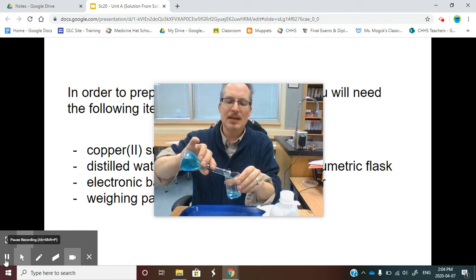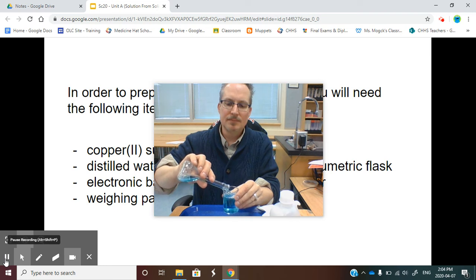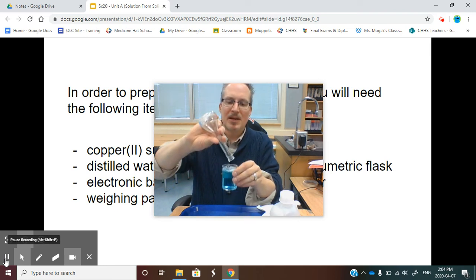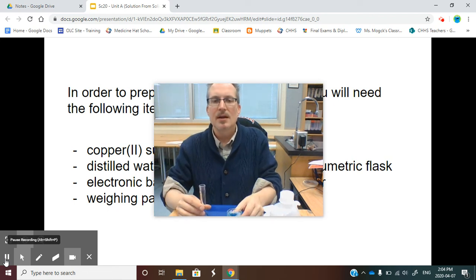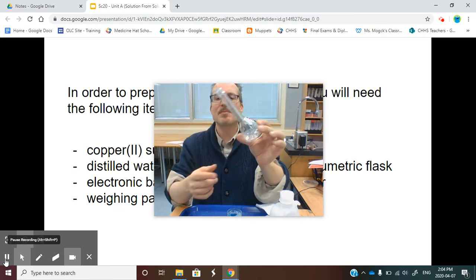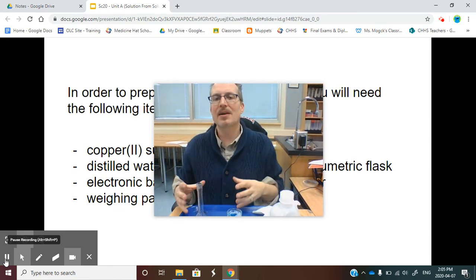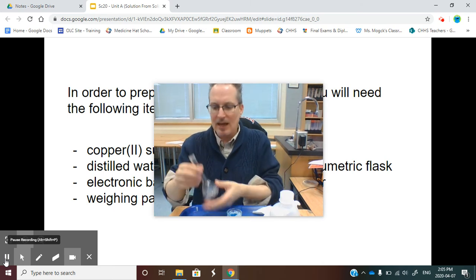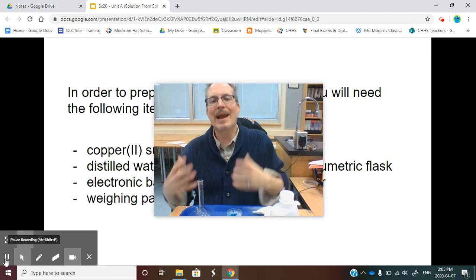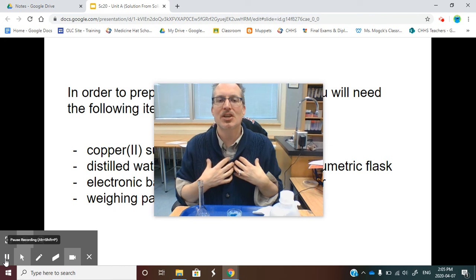Now, I'm going to pour it over here. I didn't pick a big enough beaker, but it does just fit. Now, we don't actually have 100 mils in here, right? Because whenever I pour something out, I always leave a few drops inside. We made up 100 mils in a 100 mil volumetric flask because odds are we needed 50 mils or 80 mils or 90 mils. We don't make up 100 mils because I need to use 100 mils.